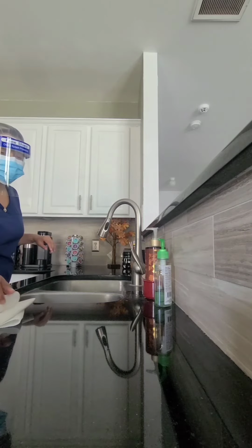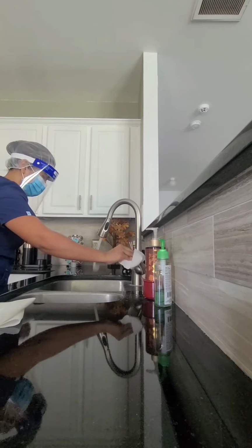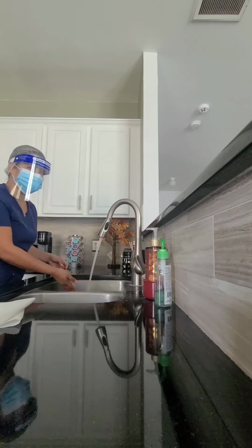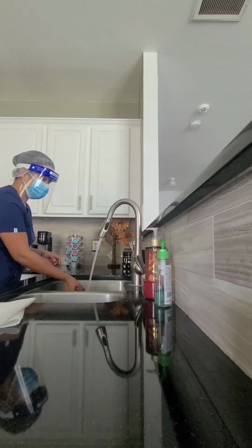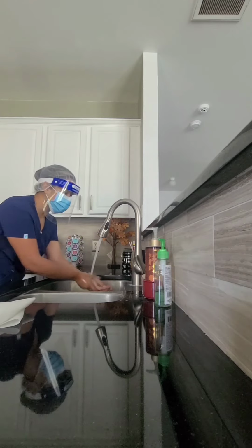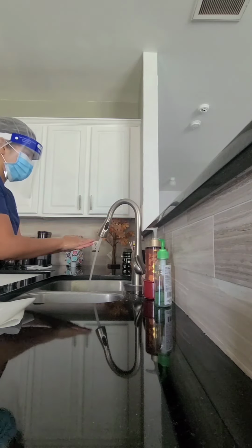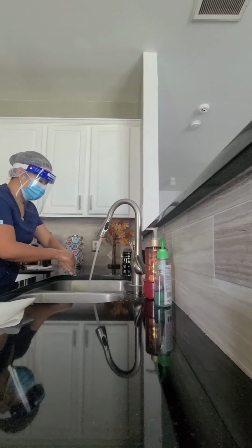And now I'm going to use paper towel to turn the water on. And I want to wait for a few seconds until the water gets a little bit warm. Alright, now that it's warm, I'm going to wet my hands and I'm going to apply some soap. And then I'm going to start cleaning my hands in circular motion.